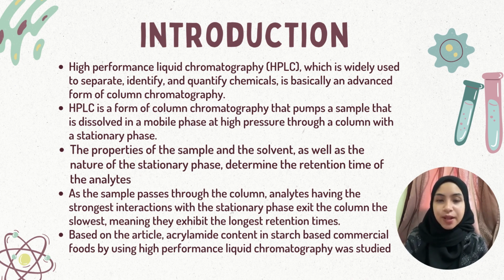The properties of the sample and the solvent, as well as the nature of the stationary phase, determine the retention times of the analytes. As the sample passes through the column, analytes having the strongest interaction with the stationary phase will exit the column the slowest. It means they exhibit the longest retention time. Based on the article, we study acrylamide content in starch-based commercial food by using HPLC.